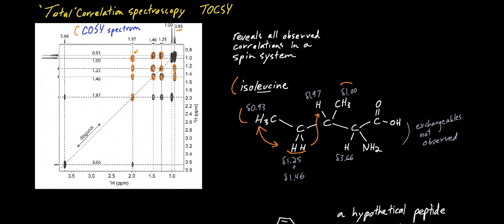Finally, we have the 3.66 way down here on the diagonal, correlating only to, as you would expect, the 1.97. So we see that correlation.